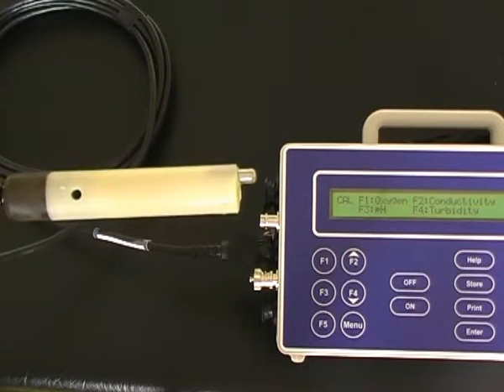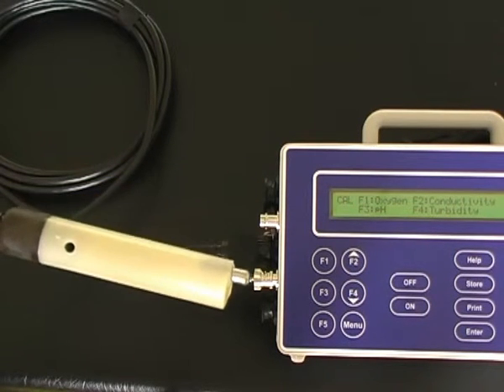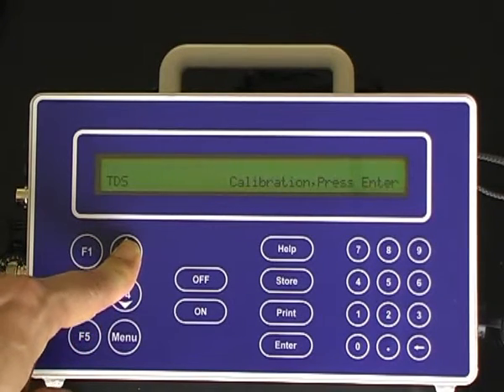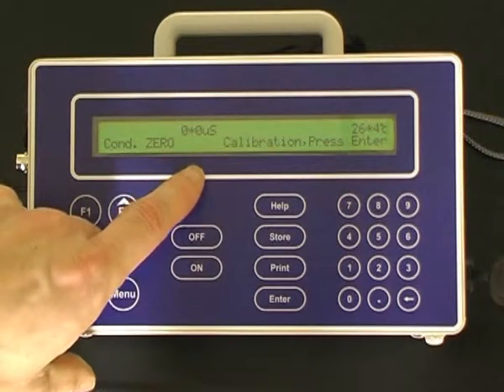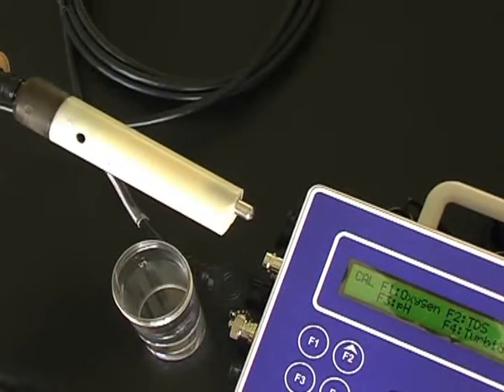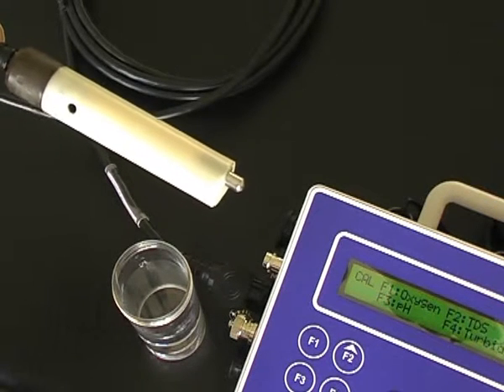The first point calibration is a dry sensor in air, which should measure zero. Press F2 for TDS. Once the sensor has equilibrated to zero, press the Enter button to calibrate. The second point TDS sensor calibration is in a calibration standard.